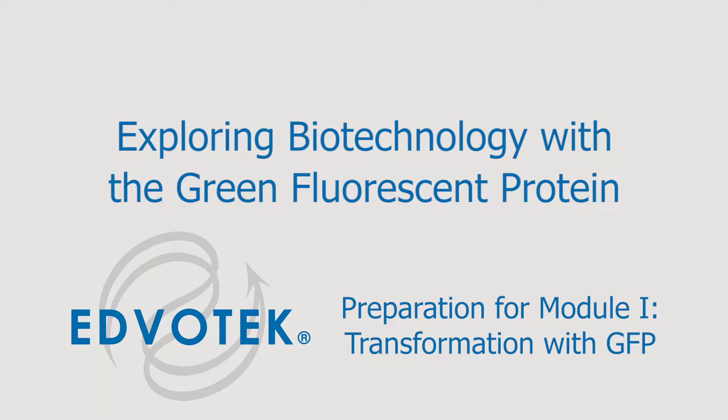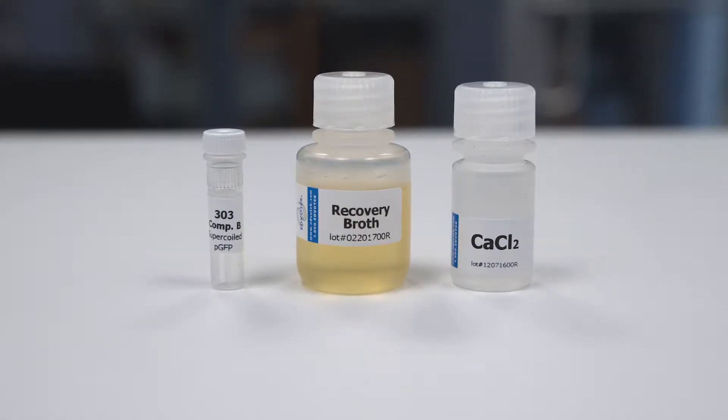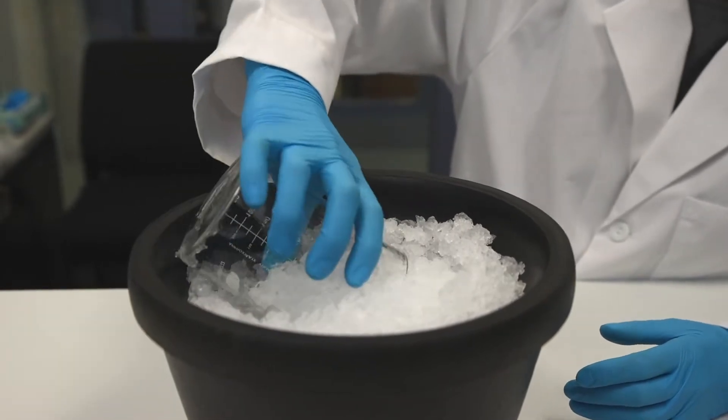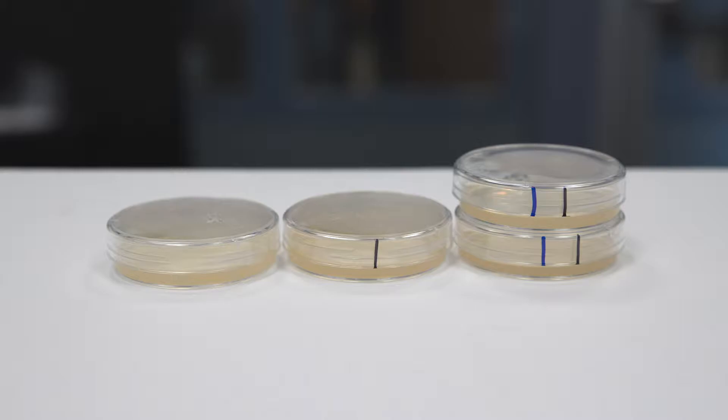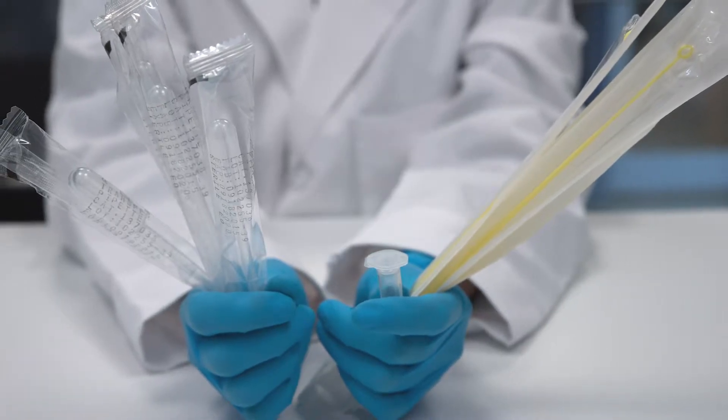For this prep you will need supercoiled pGFP plasmid, recovery broth, and calcium chloride. Each group will need crushed ice or an ice water bath, LB agar plates, sterile 1 ml pipettes, inoculating loops, and one microcentrifuge tube.